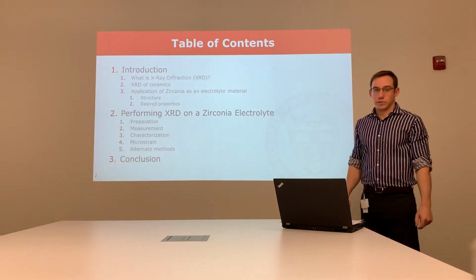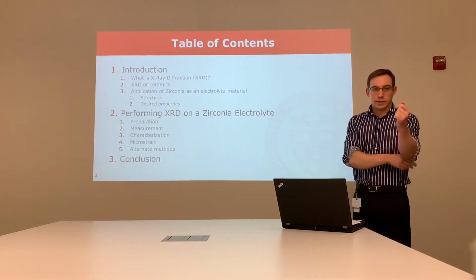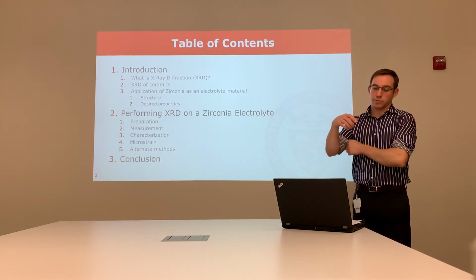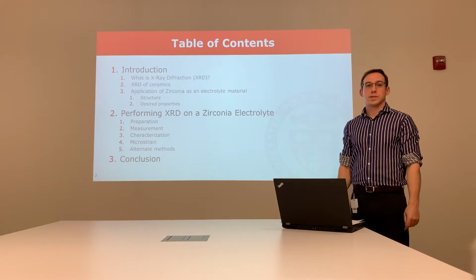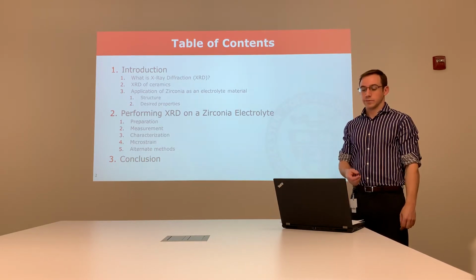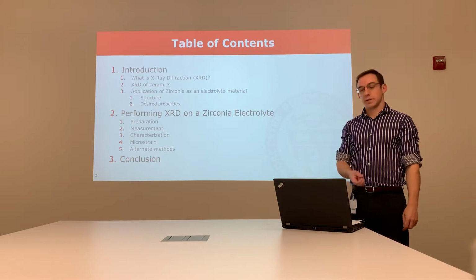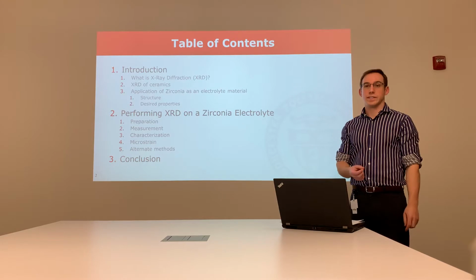To give an overview of the topics I'll be covering today, I'll start out with a brief introduction to X-ray diffraction, what that means, and how it's performed, followed by X-ray diffraction of ceramics in particular, and the application of zirconia as an electrolyte material in a direct carbon fuel cell, which is the subject of my thesis research.